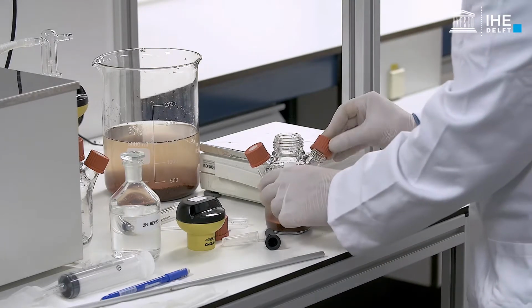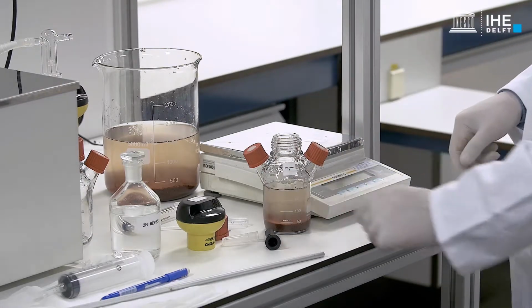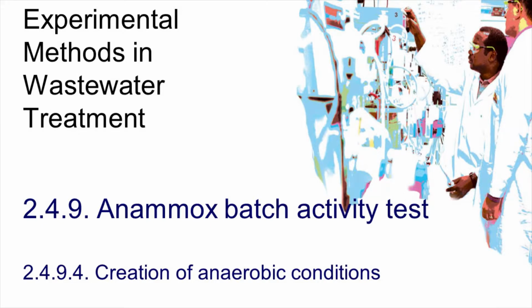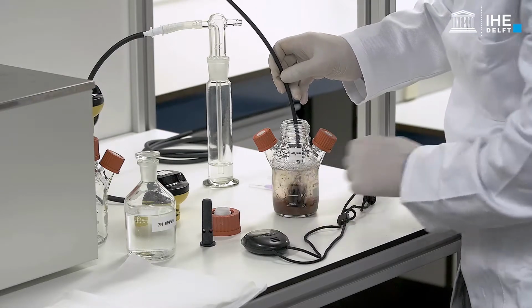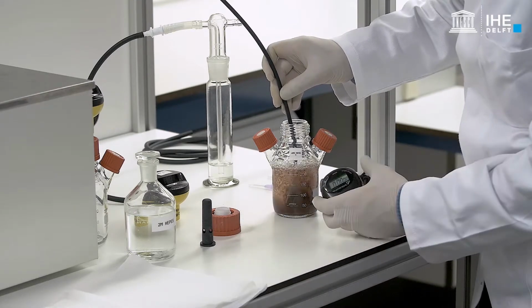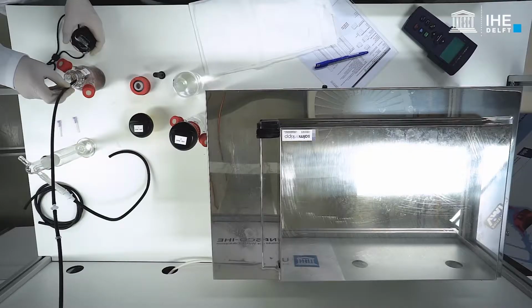Once the sludge and the pH buffer have been added, the reactor can be reassembled. In order to remove the dissolved oxygen present in the liquid phase and create the anoxic conditions required, sparge nitrogen gas in the mixed liquor for 5 to 10 minutes. Also verify the stability of the pH, which might have been altered.